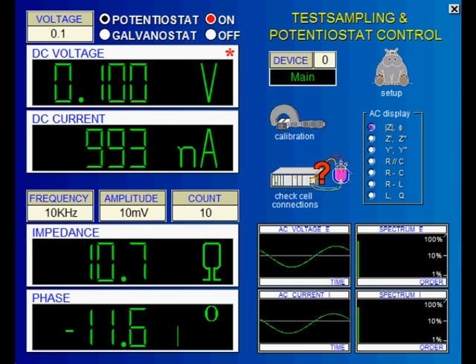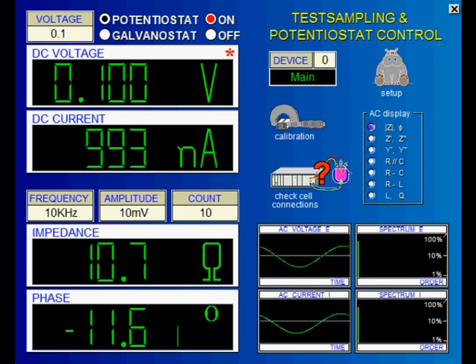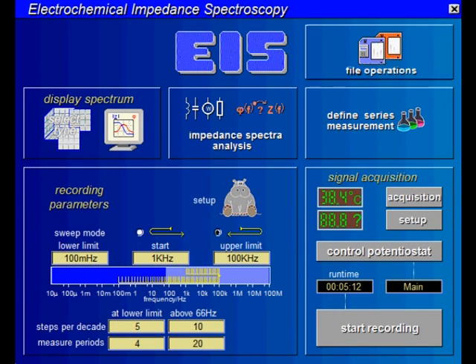Let's return now to the EIS main page. Here we have to set all the EIS scan related parameters. Above all, this is the frequency range of the scan. You set it using the upper and lower frequency input boxes.